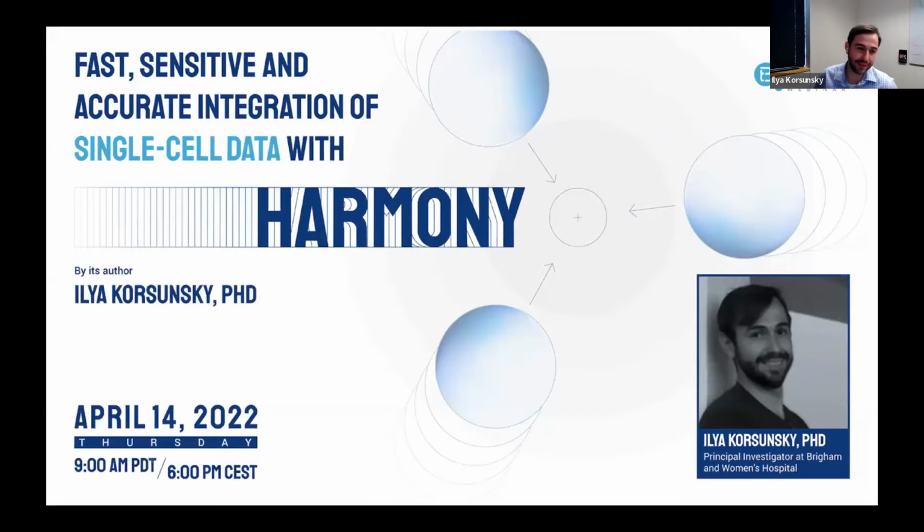Thank you, Sean. Thank you so much for the invitation, as well as the great introduction. I think you've really contextualized this problem very well. It sounds like around when BioTuring was being formed, we started analyzing these single cell data. We lived in blissful ignorance of batch effects, because in the early days we only had two batches that we were working with and analyzing for like 6 months. As soon as we got our third batch, we realized, oh, this is going to be a big problem, and so we got to working quickly on some kind of integration methods, and trying to understand this problem very well.